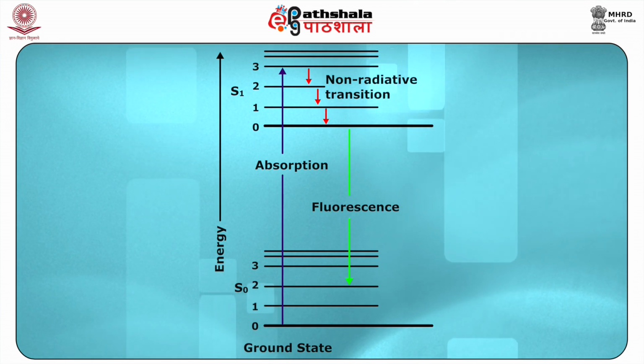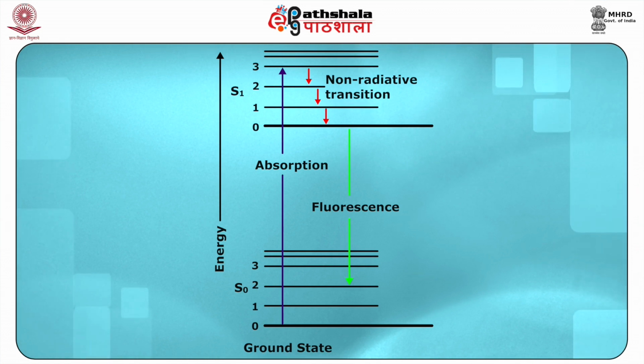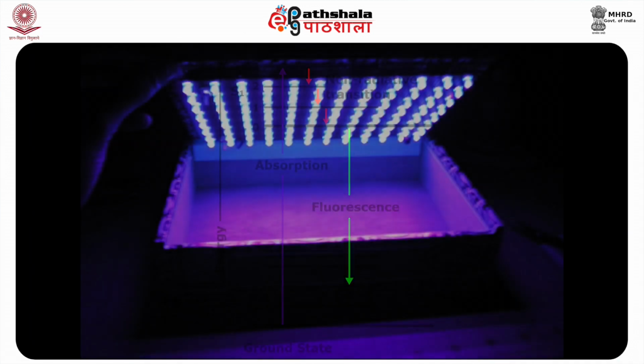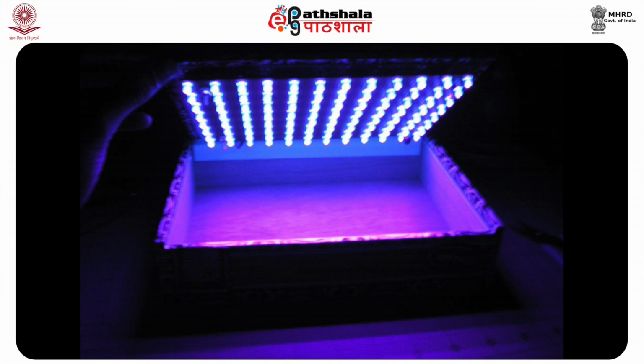For example, an invisible small stain of semen when exposed to ultraviolet radiations from a UV lamp gives a whitish blue color glow. Similarly, we can carry out examination for many other common articles of physical evidence, namely comparison of paper, currency notes, secret writing, sealing waxes, glass, threads, anthracene powder, and urine stains.